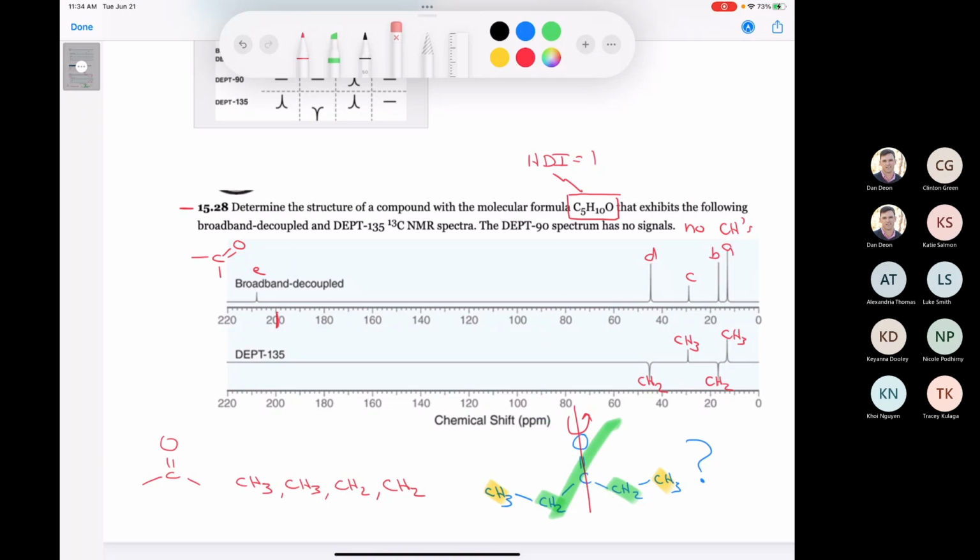It's kind of tough for me to ask you if you have any other ideas, but I think that hopefully you're following me, that the best way to put all these together would be to have one methyl on one side and then the two methylenes, and then have the methyl group over here like this. Now we have something that's completely different, okay? We have two methyl groups that are not identical. We have two methylenes that are not identical, and now we can annotate our spectrum.